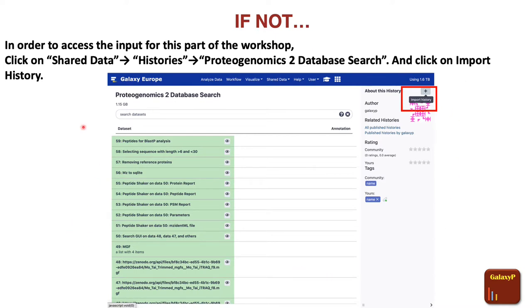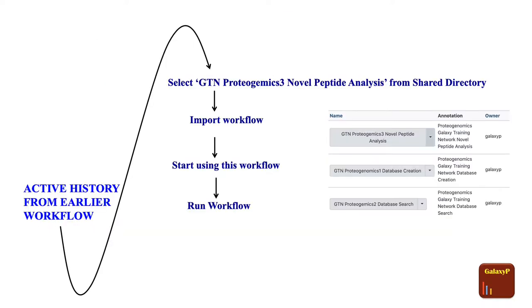Now this history will become your active history. Once you have imported the history, the next part is to obtain the workflow. To make your life easier, we have published this workflow. Go to shared data and select workflows. Search for the GTN Proteogenomics 3 novel peptide analysis by the owner Galaxy P. Import this workflow, and when you import it, select 'start using this workflow.' Now you're ready to run your workflow.